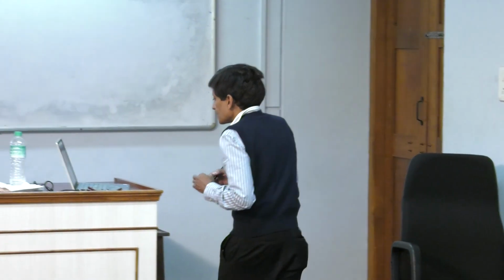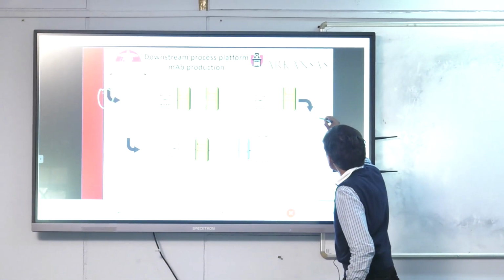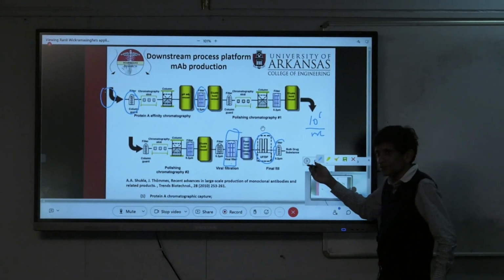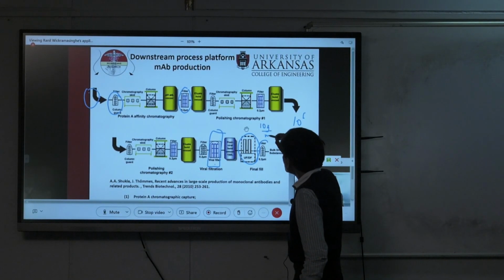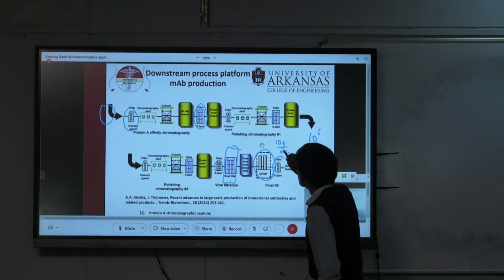The other reason is, if you were to work it out, even if you have things like, say, 10 to the 6, that's typical, say virus particles per ml. That's what you could have, say, if it were there. You look at the protein concentration. So your protein may be things like 10 grams per liter.